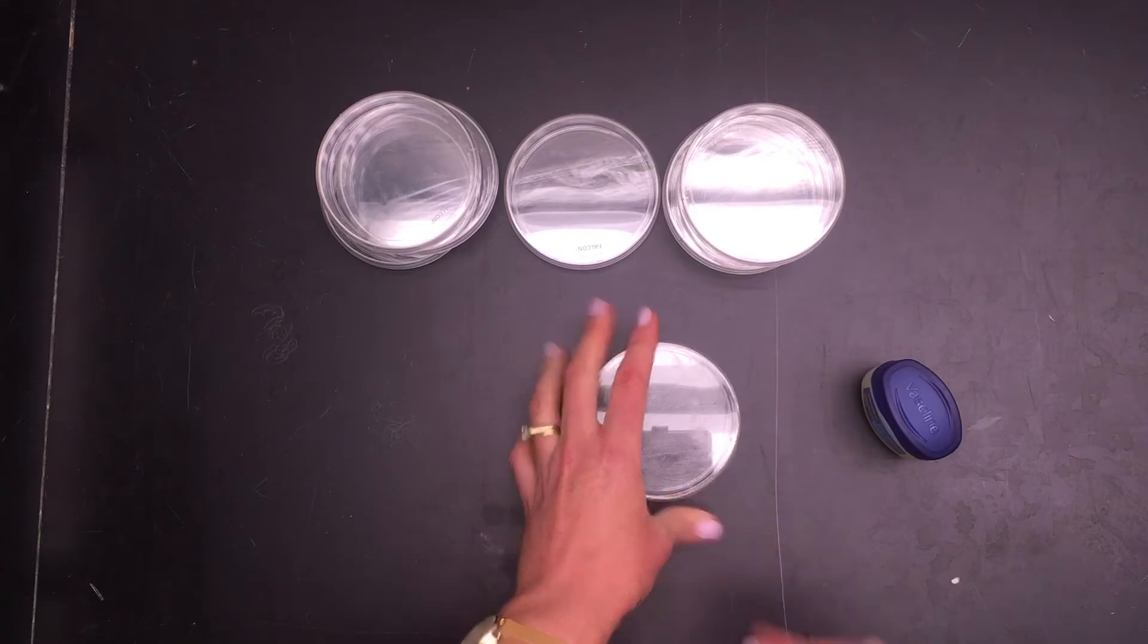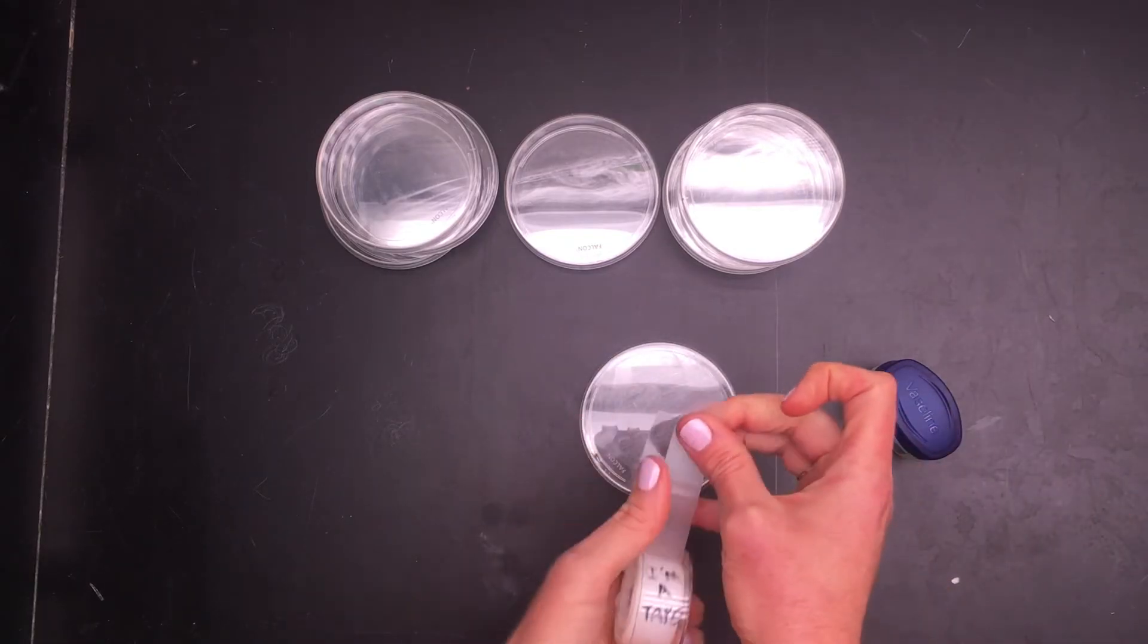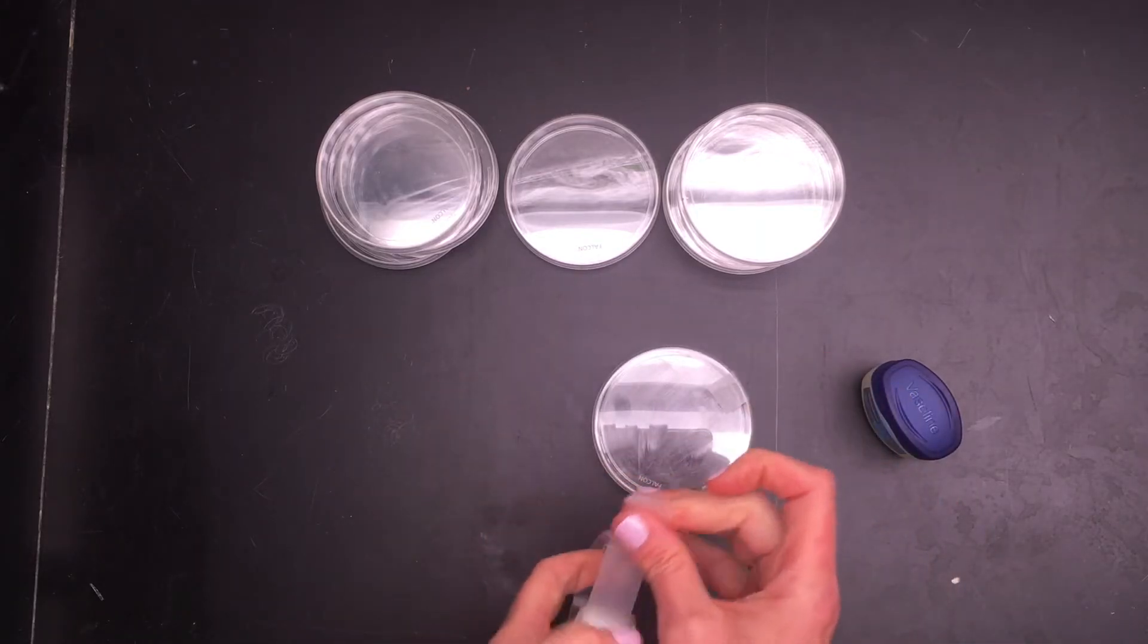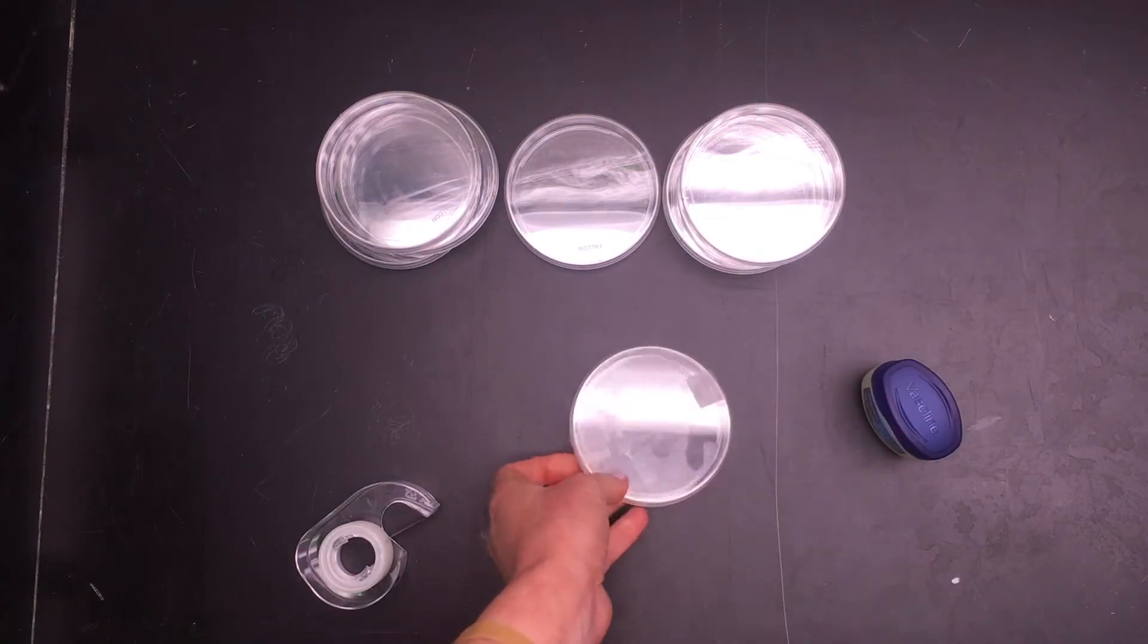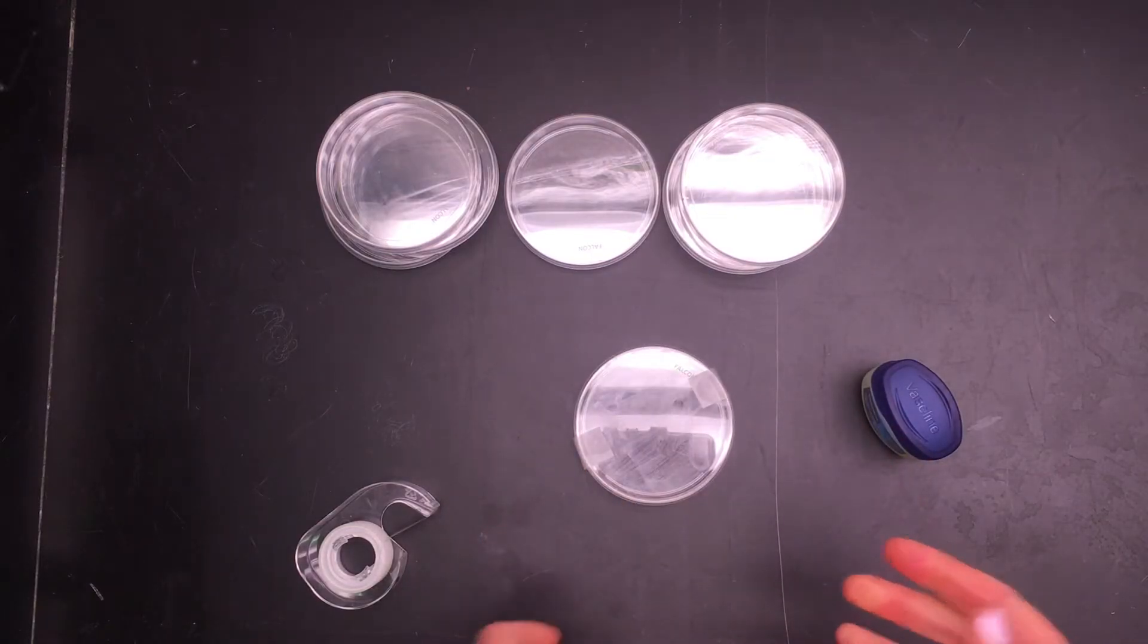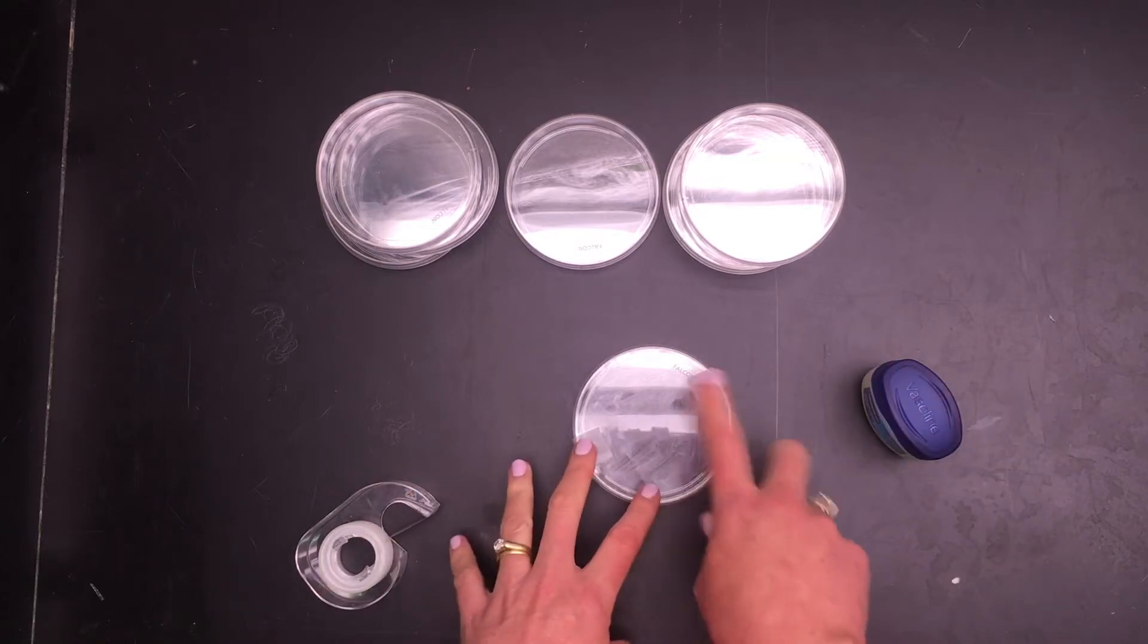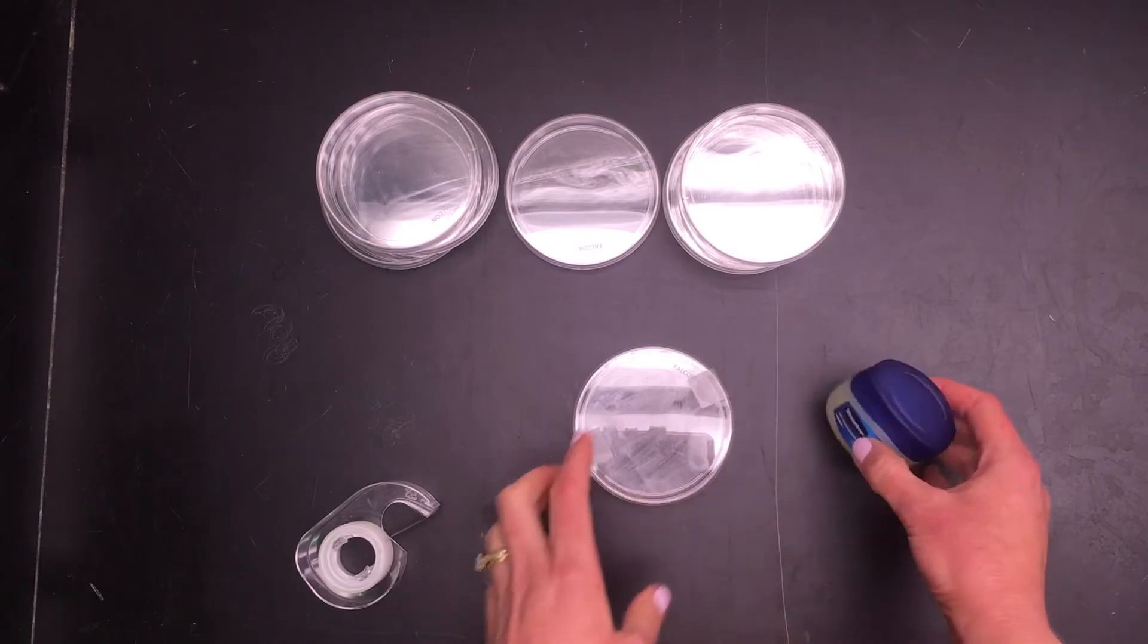Go ahead and close the dish and tape it closed with some regular scotch tape. You want to tape it so that it doesn't fall open in your backpack and gather lint or anything like that. If that does happen when you take it home or to work, you can just clean the dish out really well and then replace it with some petroleum jelly.